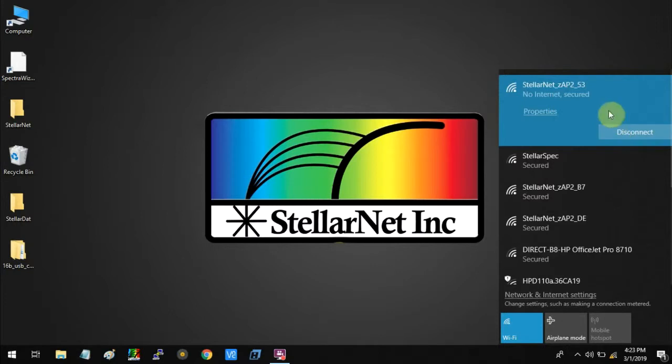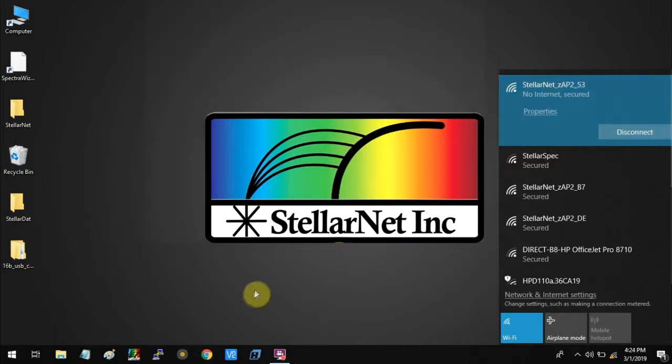As you can see, we are now connected to the access point and our ZAP2 spectrometer is connected to the computer.